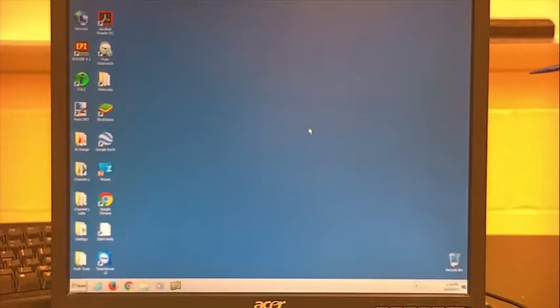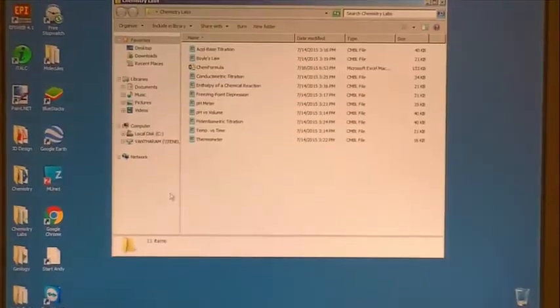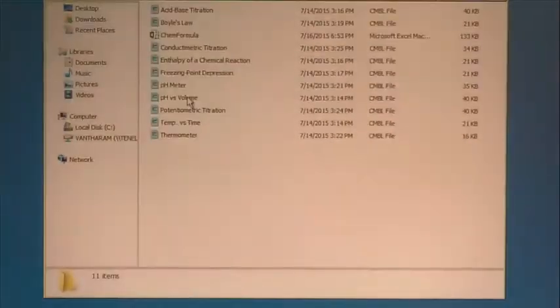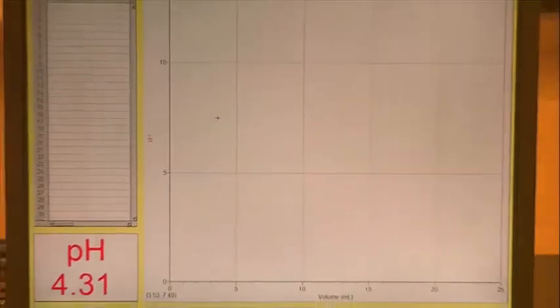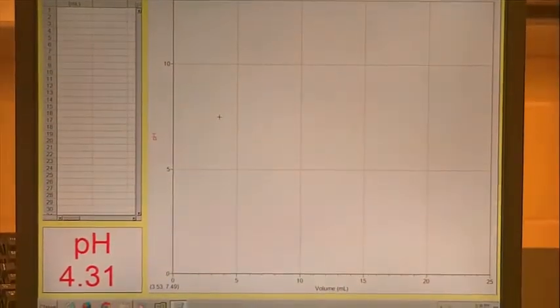Don't forget to subtract 5 mils from that according to the protocol, and you should be able to fill out that data table along the way. Now that you've finished your first titration, the second titration involves a pH titration. So first click on Chemistry Labs, and in your workstation, click pH versus volume. And you should be able to get a screen that looks like this.